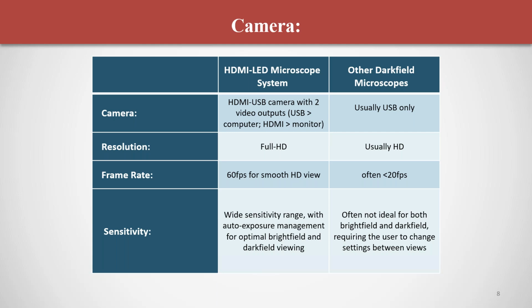But with a lot of the other USB cameras, because they're not specifically developed for microscopy and for dark field analysis, you often end up having to adjust the exposure settings and so on between bright field and dark field to actually see an acceptable image. That doesn't sound very acceptable. Yeah, it becomes quite inconvenient when working with clients.